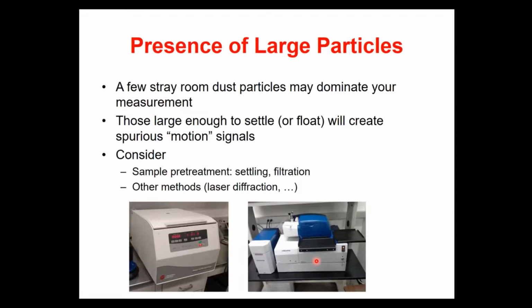Large particles are, again, the bane of our existence sometimes. A few stray contaminant particles are large enough to dominate your intensity-based measurement, and they will oftentimes come through any conversion and dominate your derived size distributions as well.